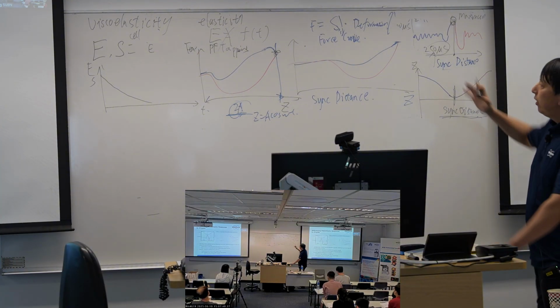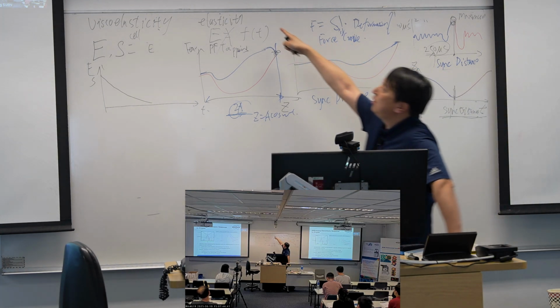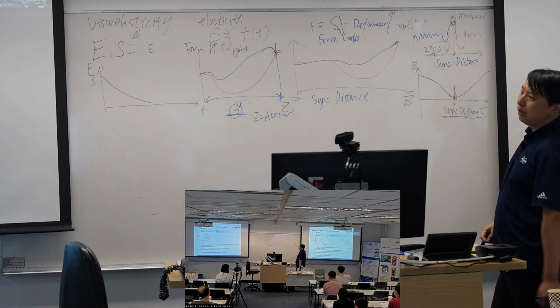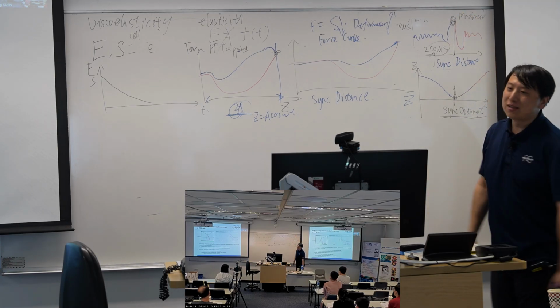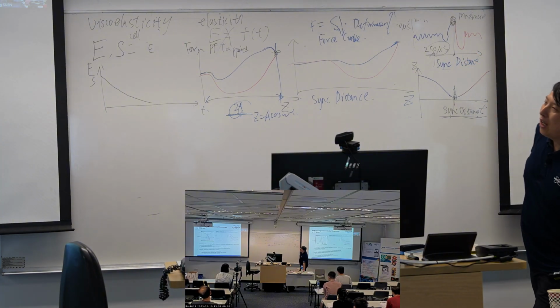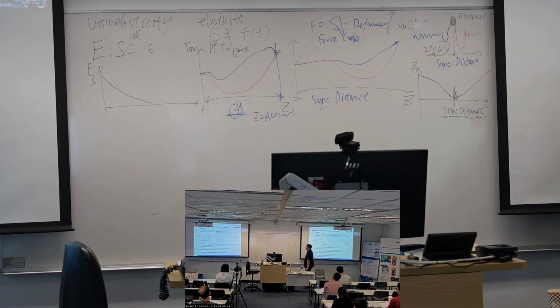And we assume our sample is elastic. If the sample is elastic, when I reach the lowest point of the Z, I should reach the maximum force on the force curve. So in 2009, when Bruker invented this technique, they assumed these two times are the same.